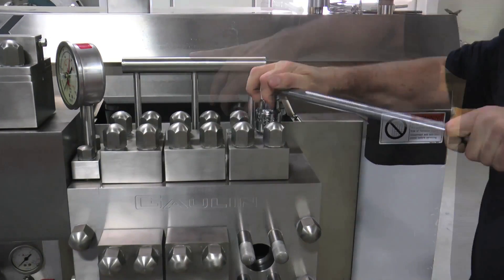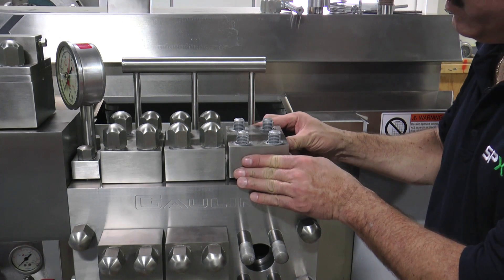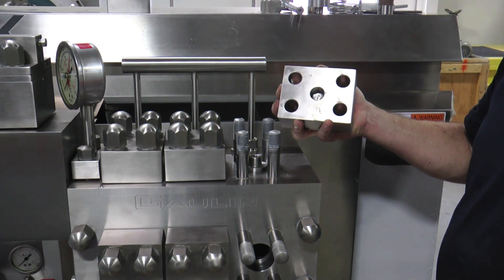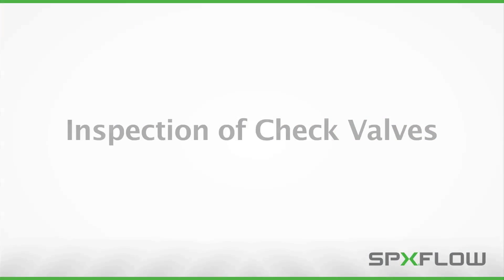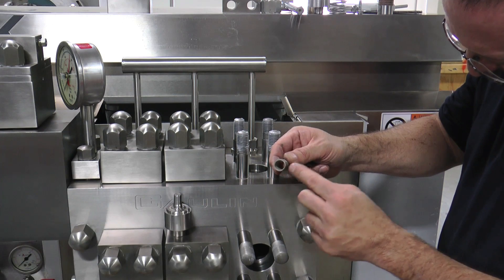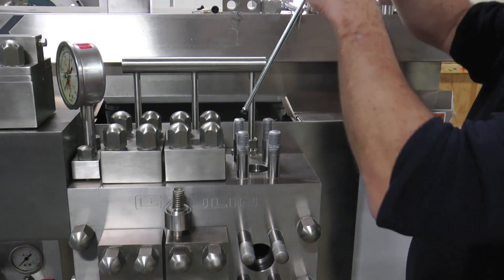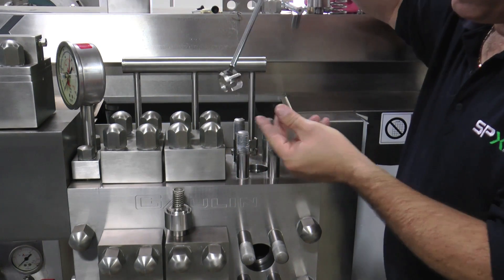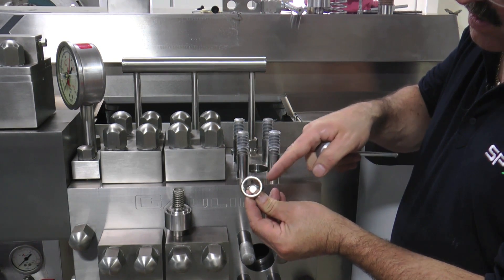To check the pump valves, remove the top cap by removing the four nuts. After the nuts are removed, the top cap can be lifted off the studs and removed. A small wrap with a rubber mallet may be necessary to assist in cap removal. Next, remove the ball stop and the valve spring. Inspect the spring for any wear and make sure there is no sign of rubbing on the inside wall or on the stop itself. Remove the valve guide using the mechanical gripper tool from your homogenizer toolkit. Reach down and grasp the valve guide that sits on top of the check ball. Inspect the inside for any signs of wear, specifically on the internal part of the guide where the ball rides.